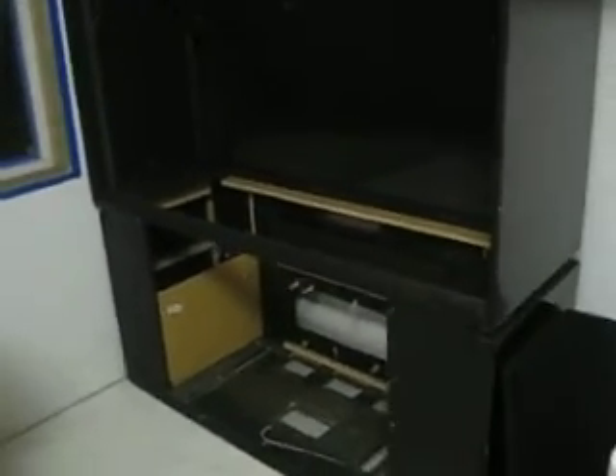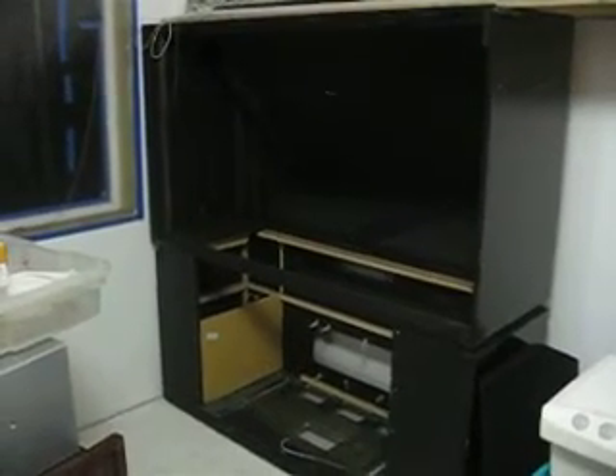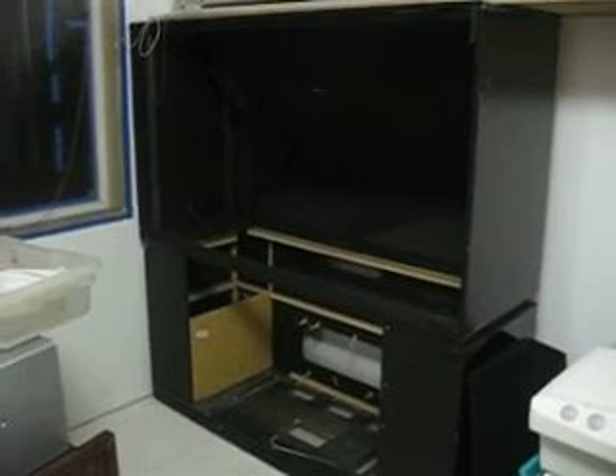It'll take me a while, but I'm going to show this at its various stages of development so that you can see how to make an inexpensive and practical laminar flow hood.